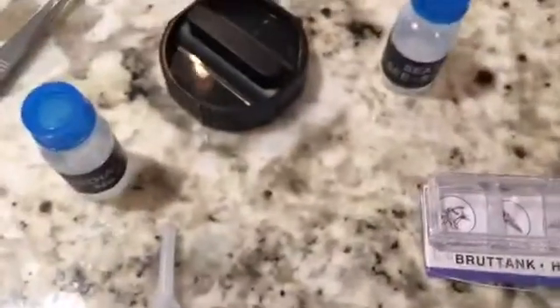Here's the manual, and it also includes sea monkeys or brine shrimp — there's some sea salt and brine shrimp eggs, so you can grow your brine shrimp, put them on a slide, and check them out. They're pretty amazing. Also included are tweezers, some gum media — I've got to read up on what that's for — and yeast, so you can grow yeast and actually visualize the yeast cells. Pretty darn cool.